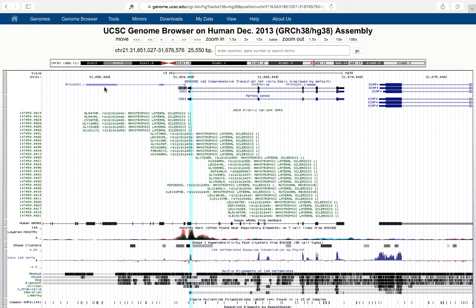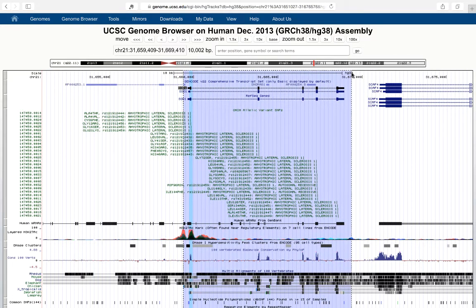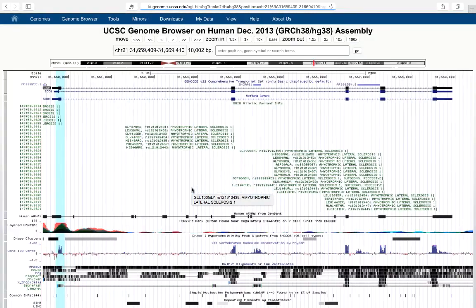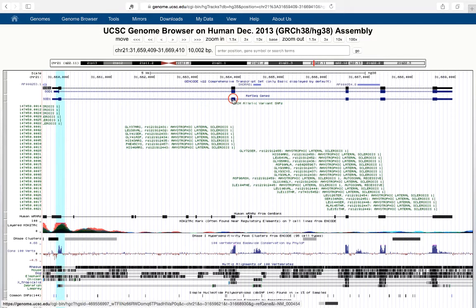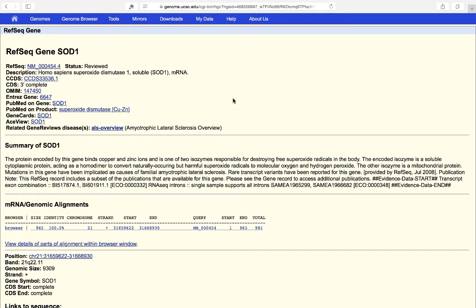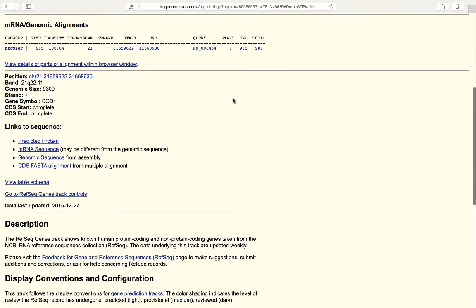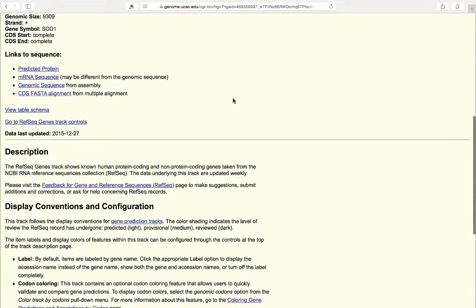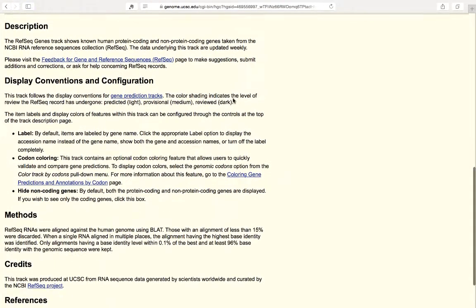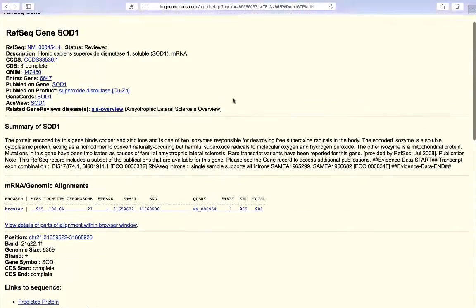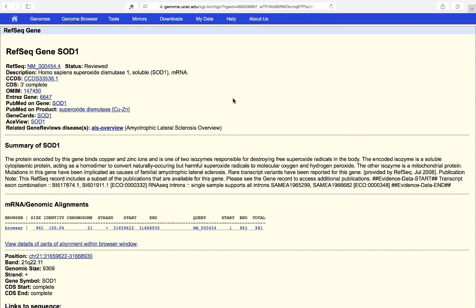Finally, I want to end by discussing the gene detail page. If you want to learn more about a particular gene — I'll zoom in here again on SOD1 — you can click on any of its exons and you'll get information about that specific gene. Here you can see the gene detail page for SOD1: you get a RefSeq ID, the reviewed status, a short description, and some other information including the Entrez gene number, PubMed information, gene cards ID — and these all have links through to these databases. There's even a link through to a related disease overview, then a short summary, information about the alignment to the assembly, the position, the band, the genomic size, the strand, and links to the sequence. So this is a very powerful tool because it pulls together into one place lots of different information about the gene that you're interested in.